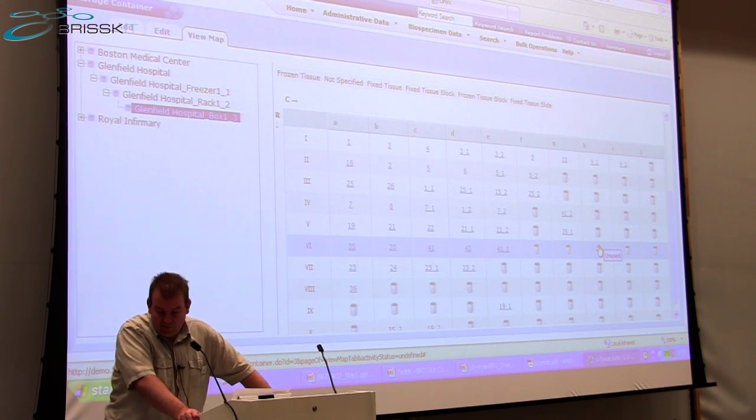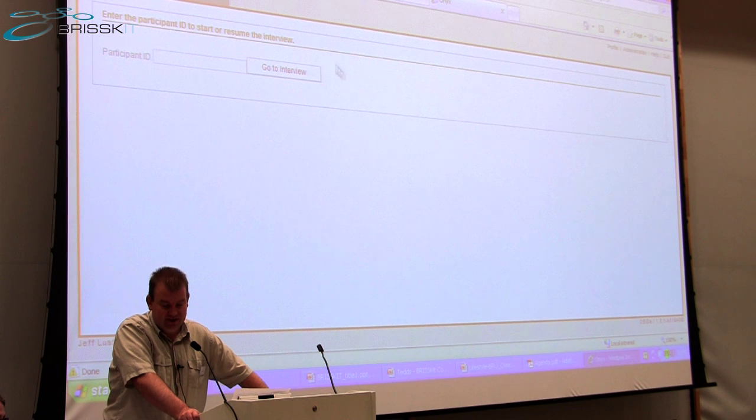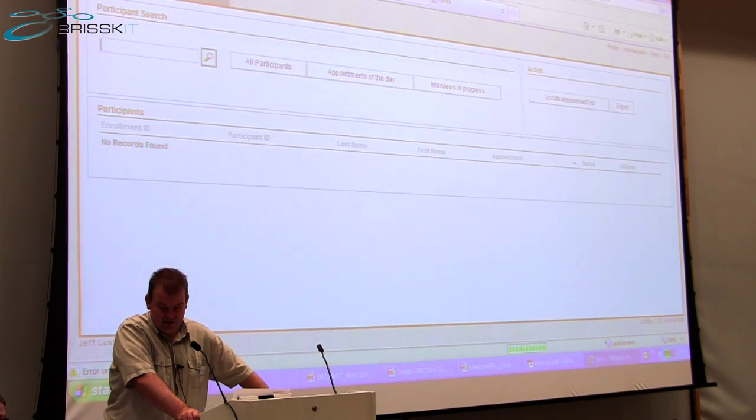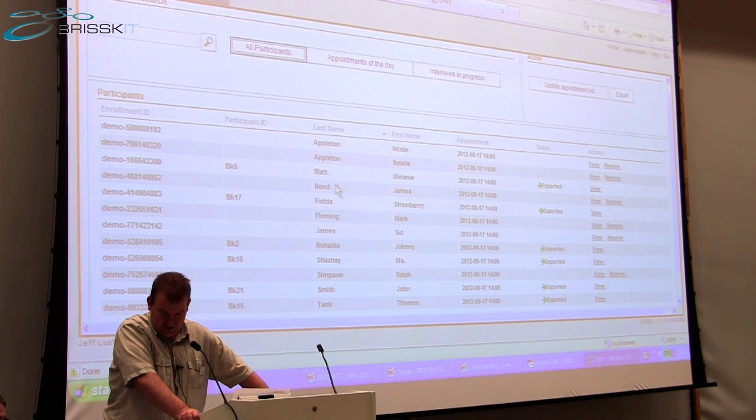So out of CA Tissue and into Onyx, by the same process, CiviCRM will have populated Onyx with a stub record for the participant that we recruited. And there he is.